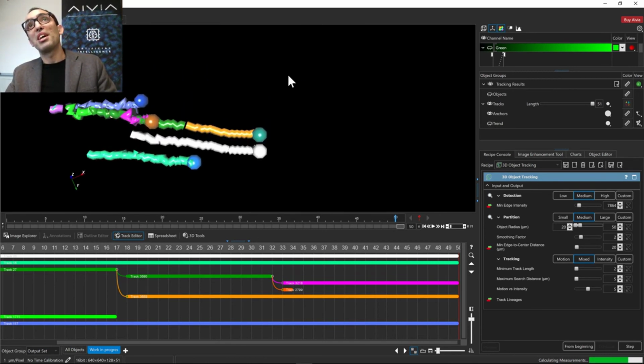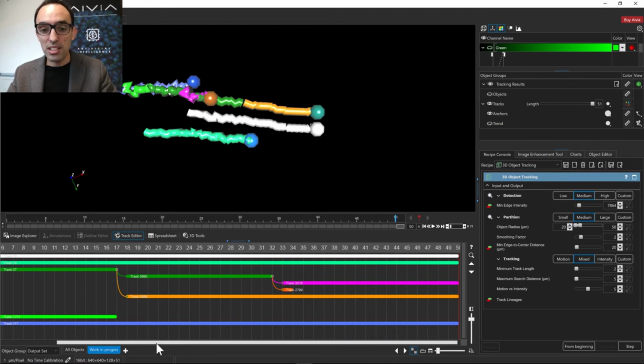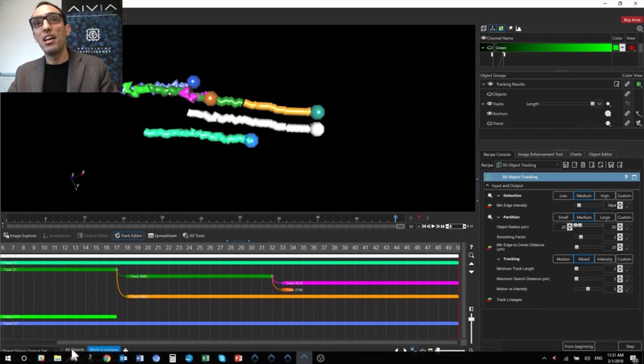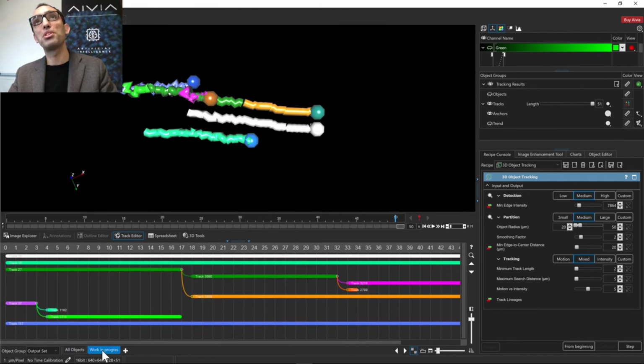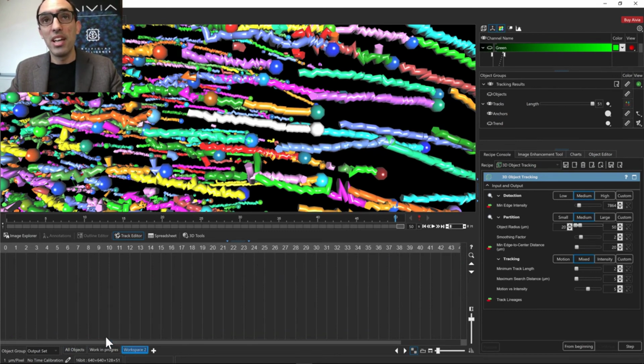So that's a little bit of a crash course on track editing. You can do all the track editing down here. The visualization is updated on the fly. We have quite a few options to help you with that. One of them is the hiding of the tracks that you're not currently editing. But all of these workspaces are connected up. So if you are back in the all objects view, you will see all of the objects, including these work in progress ones. And you can have as many workspaces as you like.